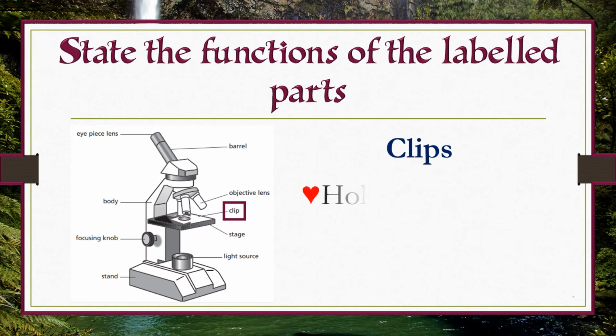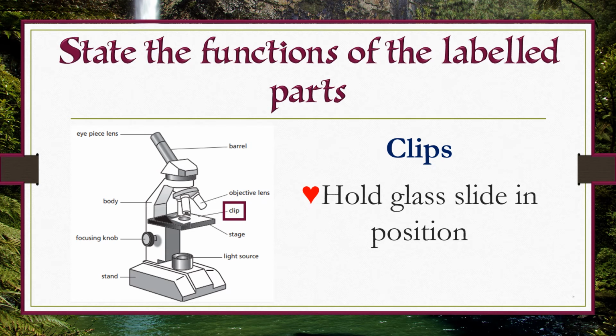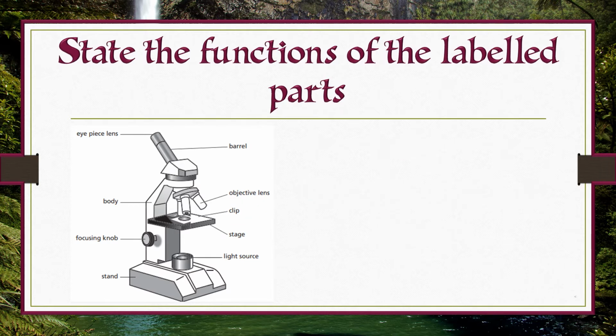Clips. Clips hold the glass slide in position. The body tube.